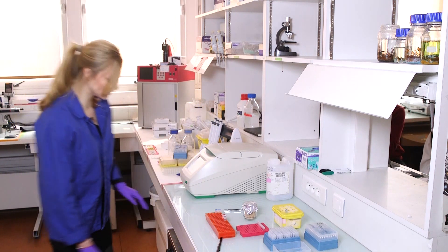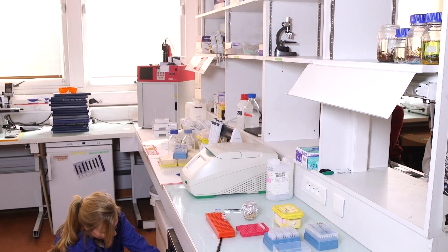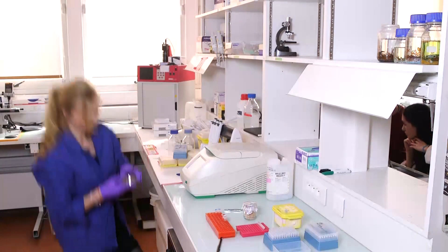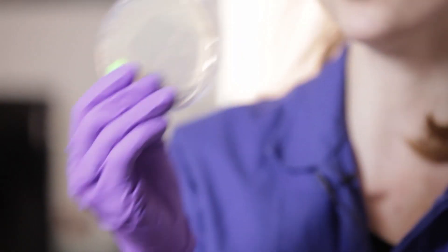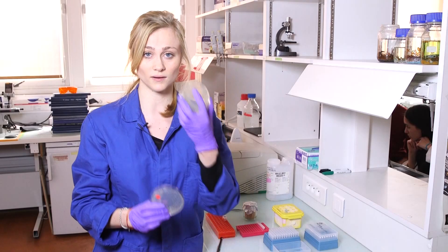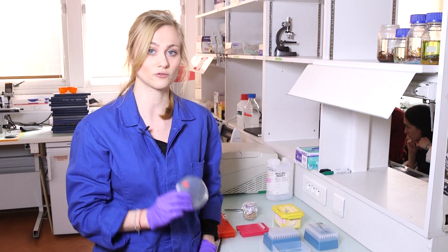Let's get my petri dishes from the incubator. So here I have two plates. One plate with colonies that should have the plasmid that I transformed. And this plate has colonies from a bacterial strain — the same strain as this one, but without the plasmid. And I'm going to use this as a negative control.